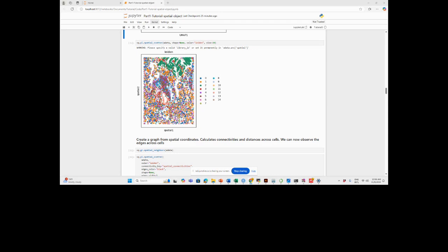That's the reason we can now overlap at the level of single cells, which is an approximation that we do using the center of the cells obtained from the spatial data after segmentation. We estimate the center, and now we cut from that center the cell in the morphological data. As I said, there is some error there. There is an estimation. Any other question, or does that explain it?